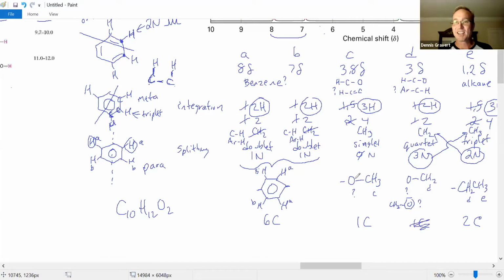All right, so I connected these 2. Yeah, that's what I did. I said, okay, so I put them here, peak D. So I have 9 carbons. I'm missing a carbon. Yeah, it helps to draw things out. It's getting a little messy, but there's a carbon. And if I want to put the CH2 group next to benzene, I still have an oxygen. I need a double bond. I need a pi bond. So there's 4 degrees in this benzene ring, and now here's my 5th degree. No H's on this, so no peaks from this group.